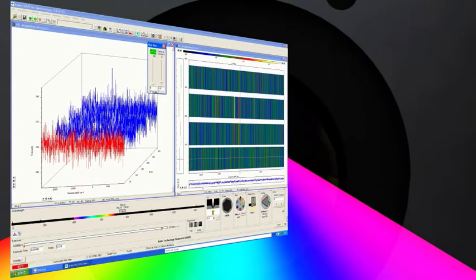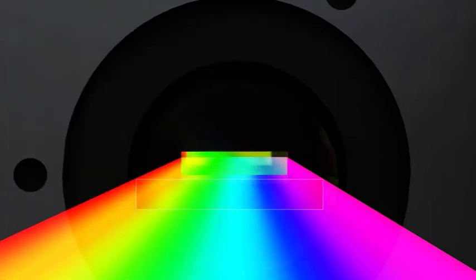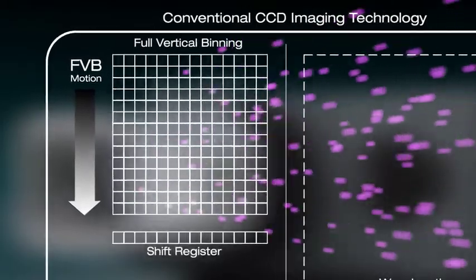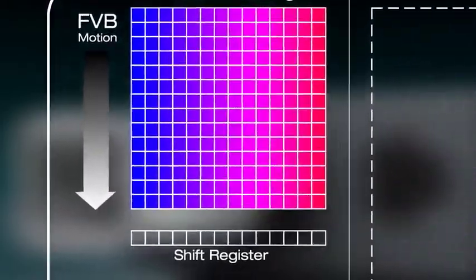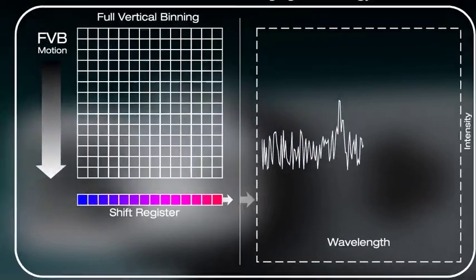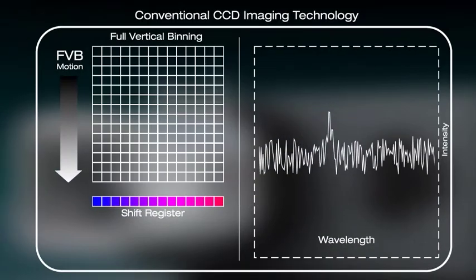When incoming photons reach a CCD detector, electrons are generated proportionally to the QE of the silicon bulk. For spectroscopic applications, electronic signal stored during the useful exposure time is then binned in the readout register, also known as the shift register. For conventional CCD structures, signal is directly shifted to readout electronics for spectrum graphical processing.